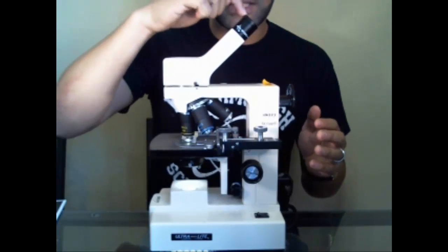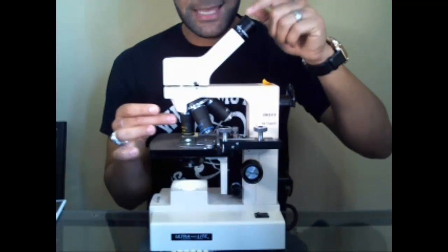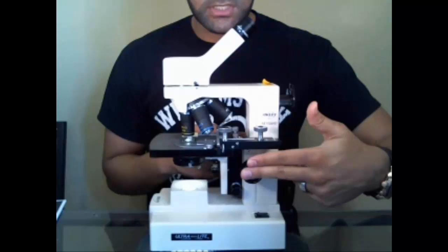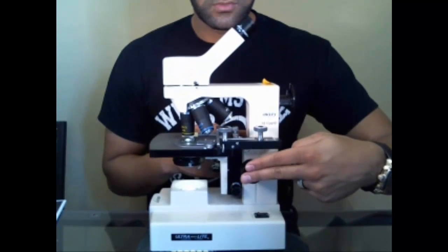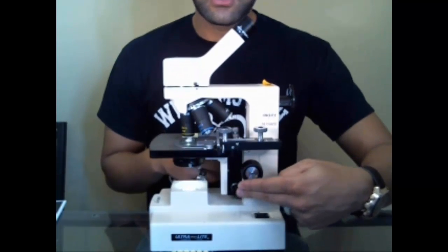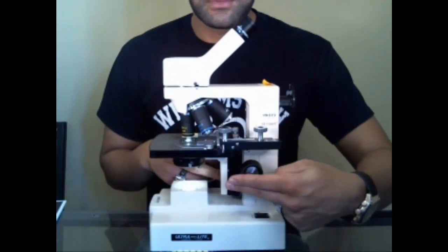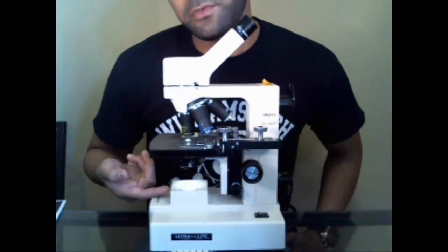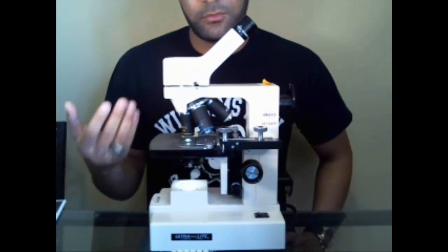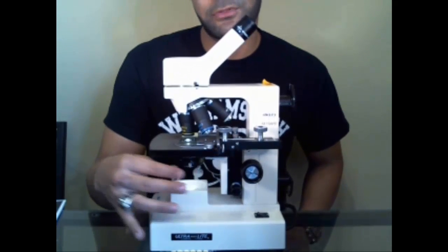So that's about it for the compound microscope. You know the basics: your eyepiece with 10x magnification, your three objective lenses giving different magnifications multiplied by 10 with the eyepiece — either 100x with low power or 400x with high power. You have your coarse adjustment knob only for low power movements with the yellow objective, and your fine adjustment knob only for high power so you don't cause damage. Understand how the lighting works: light comes from underneath, so what you're looking at must be thin enough for light to pass through, and the diaphragm helps you find the right balance of light.